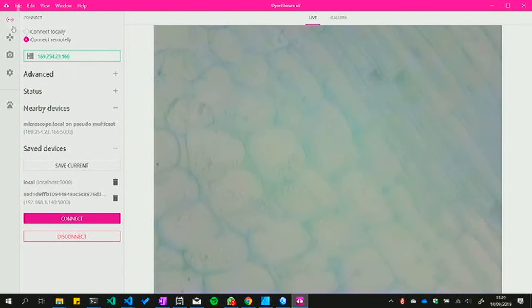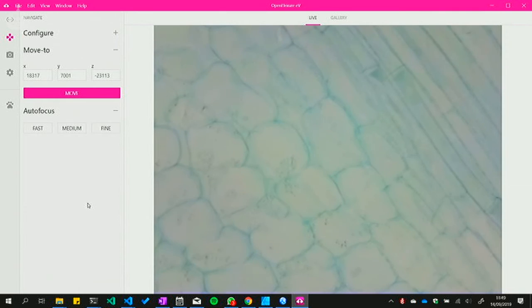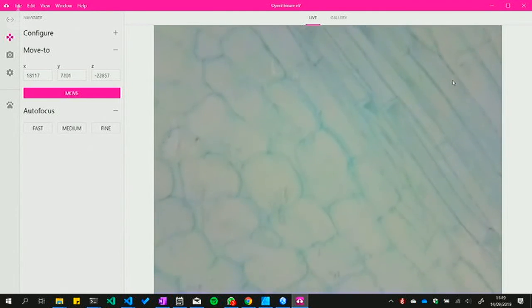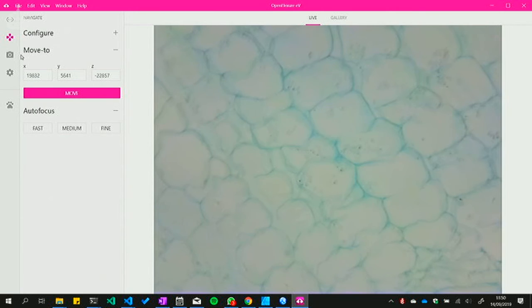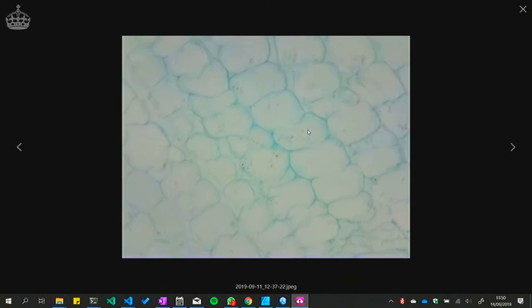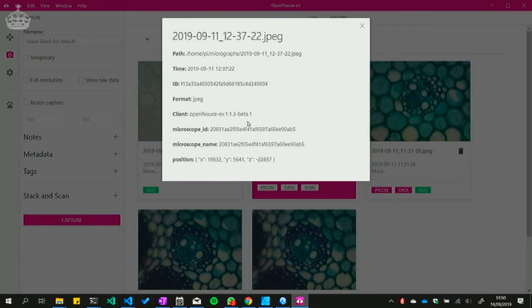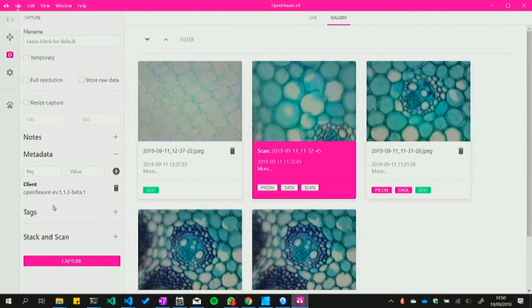If you're running it directly on the Pi you'd just connect locally, but because I've got a last-minute ethernet cable plugged into my laptop, I'll connect remotely — it's discovered there's a microscope nearby. If I click connect, we now get the image from the microscope. It's not in focus, so if I click fast autofocus — it's not as fast as your phone but for a microscope, trust me, this is quite good. You can pan around the image using arrow keys, making tiny movements in the XY stage. If you see something interesting you can double-click on that region and it will bring it into the centre of the frame.